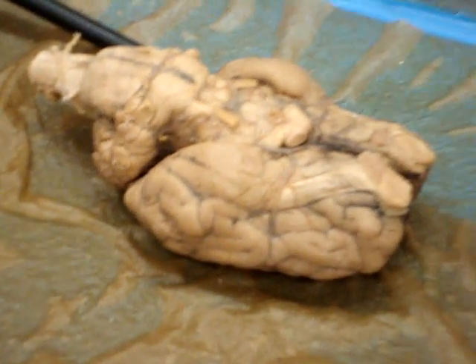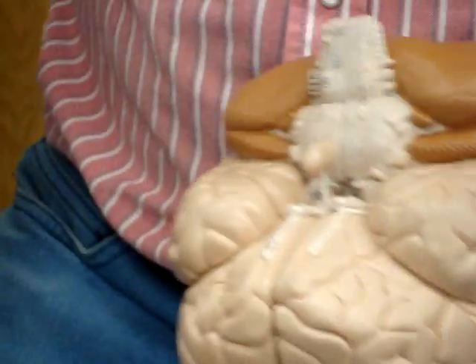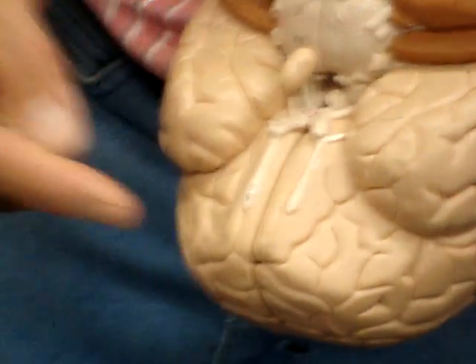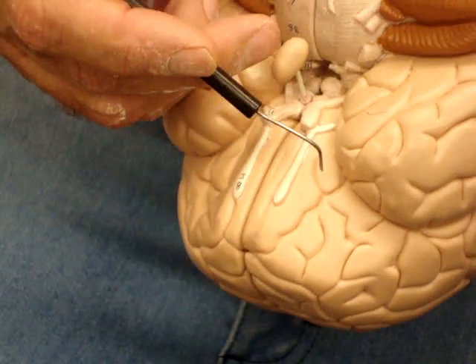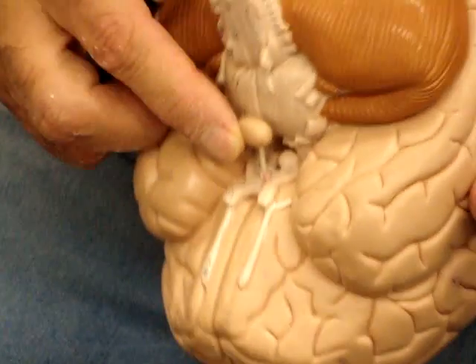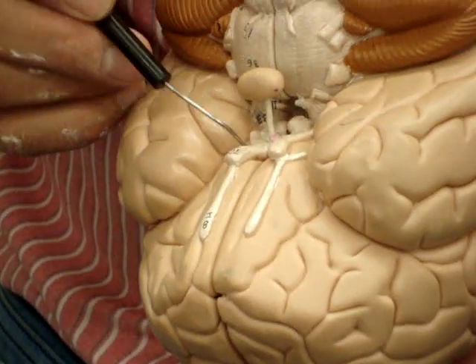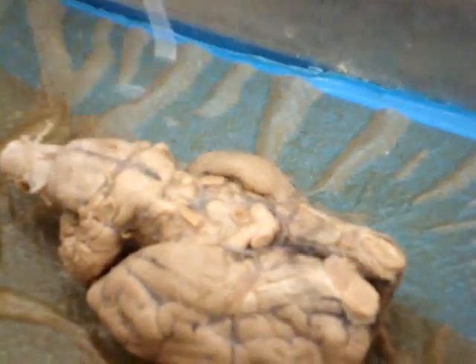Grab me a brain over there and put it together, please. This one with that one. I think that's the way it goes. All right, so there's your olfactories. There's your optic nerves. Your eyeball would be there, and this would go to that eyeball. Can you see that they kind of make an X back there? They cross. That's the optic chiasma. What gland is this? Pituitary. Okay, so that's the optic chiasma.